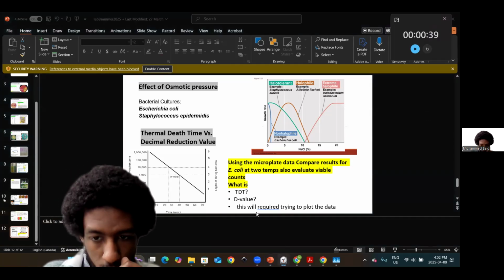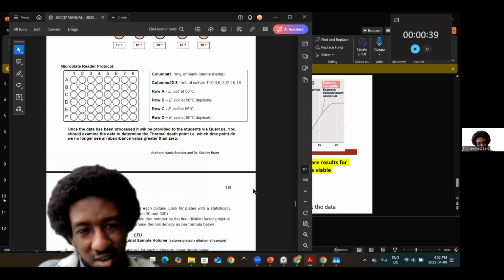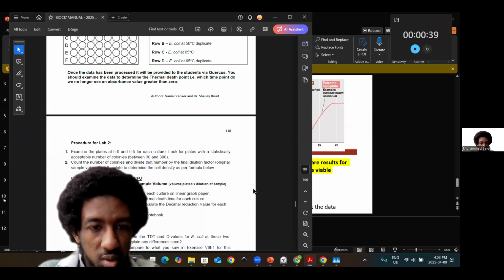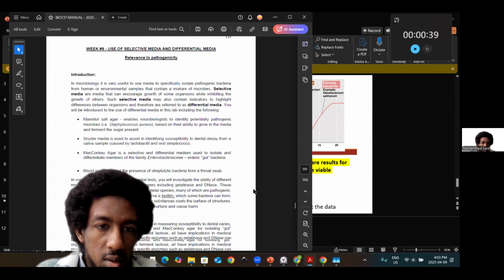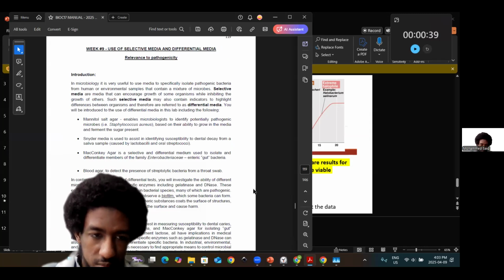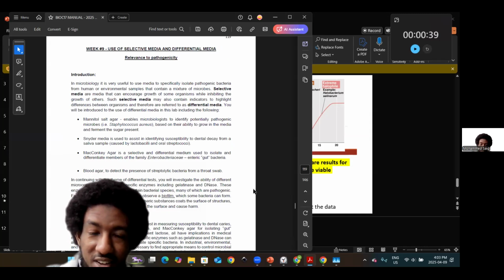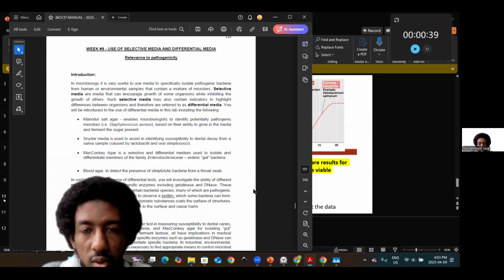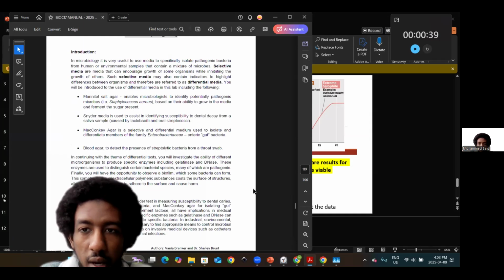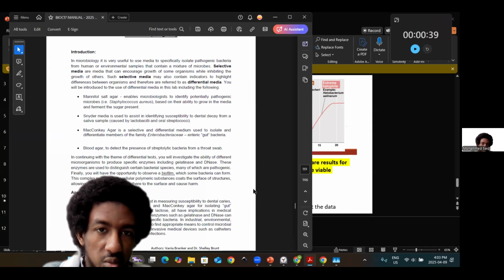Now I'm just gonna go back. I don't know if I have time, but inshallah ta'ala, I just briefly wanna, okay, let me see. We have our last lecture to go through, week 10, which is the lysozyme assay, and pretty much incorporating everything that we've looked at thus far. So let's go briefly now to week 9, with the lab manual, so that way at the end we can compare what we've garnered, and inshallah ta'ala conclude.